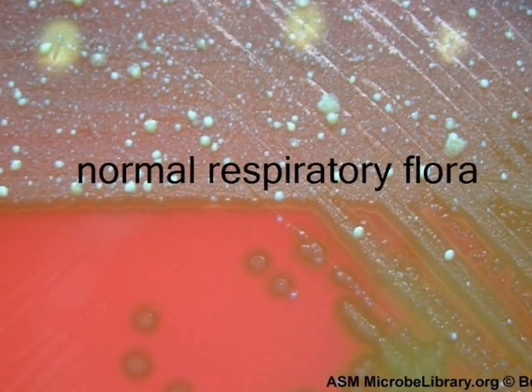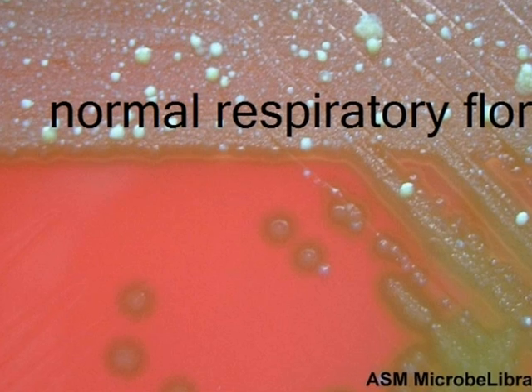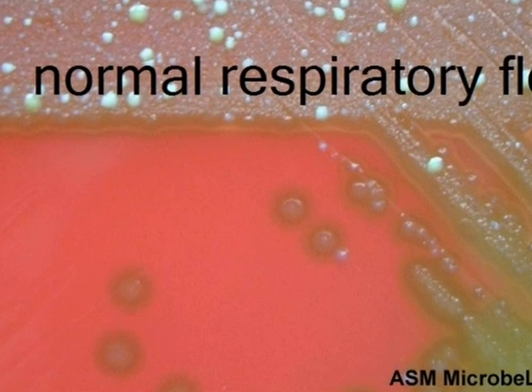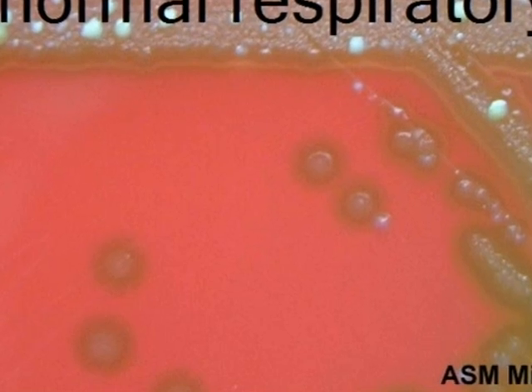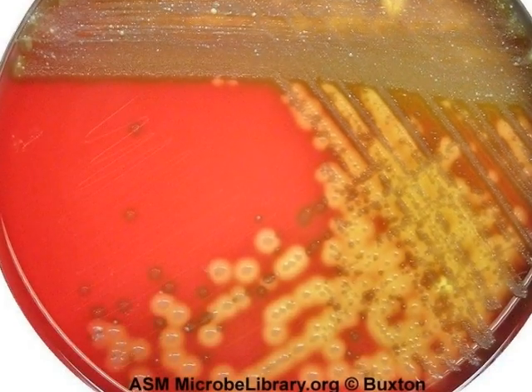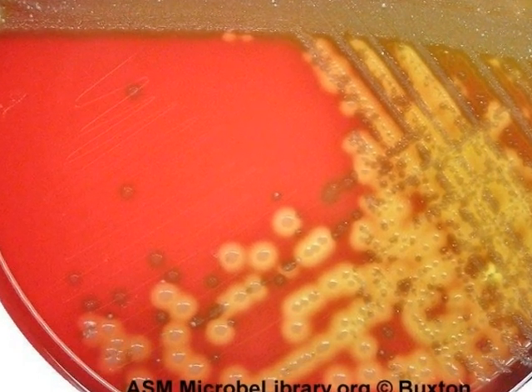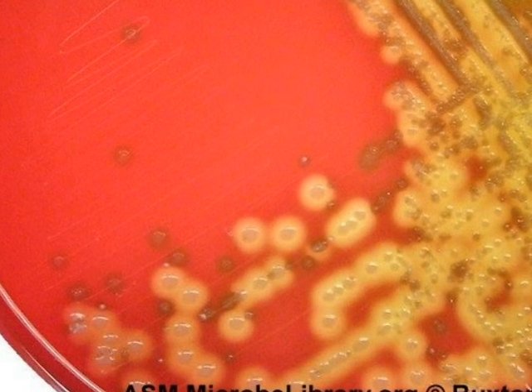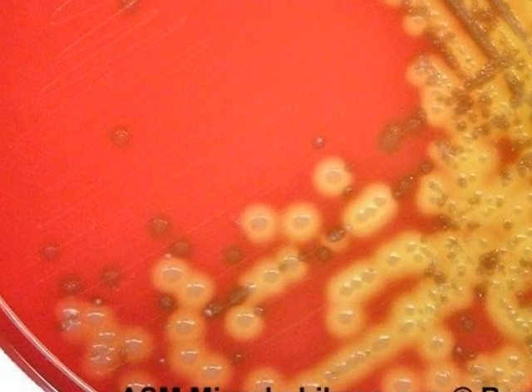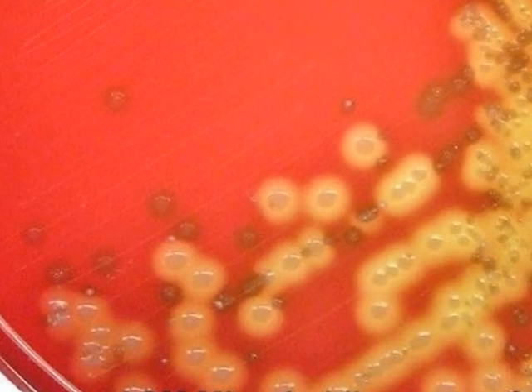Here is an example of what blood agar plates swabbed from the throat might look like. Note the appearance of the alpha hemolytic colonies and one gamma hemolytic colony in the isolated colony streak. In this culture from the throat, beta hemolytic colonies most likely indicate Streptococcus pyogenes, a true pathogen. Notice that the beta hemolytic colonies are also mixed within alpha hemolytic colonies, which are normal flora.